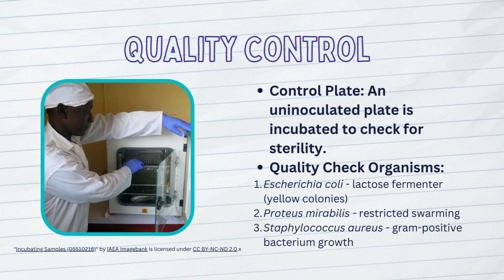I've basically mentioned this control plate in all the previous quick overviews, and consistently it's something you're going to need to do if you're preparing your own medium, to make sure that indeed it is sterile, and that when you perform any tests and there is growth, you know for sure it is coming from the patient's sample, not from contamination during preparation of the medium itself.